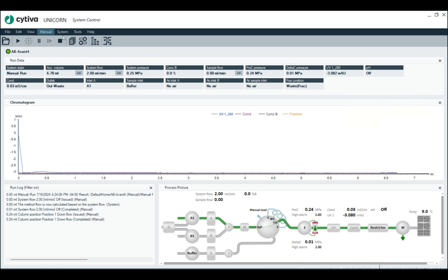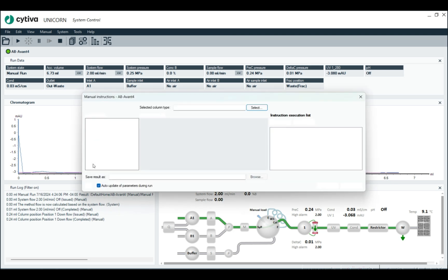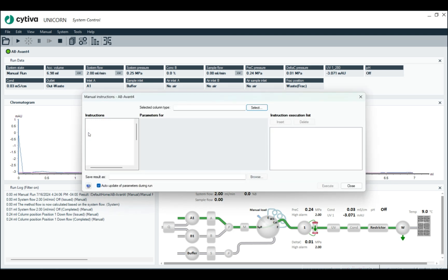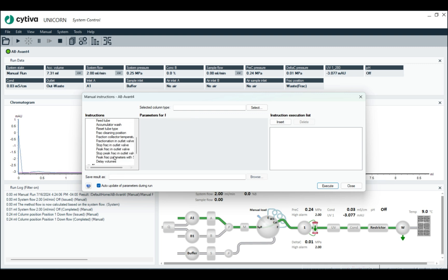And so how we start setting up that fractionation, where it does peak fractionation, is we go to execute manual instruction, and then we go to fraction collection. So here's peak fractionation right here.